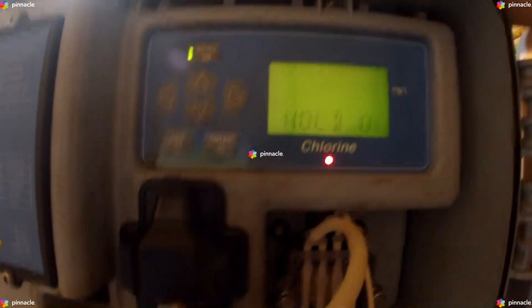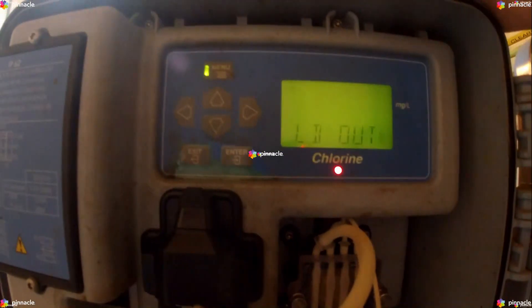The red flashing LED indicates that the hold output of the instrument has been engaged.